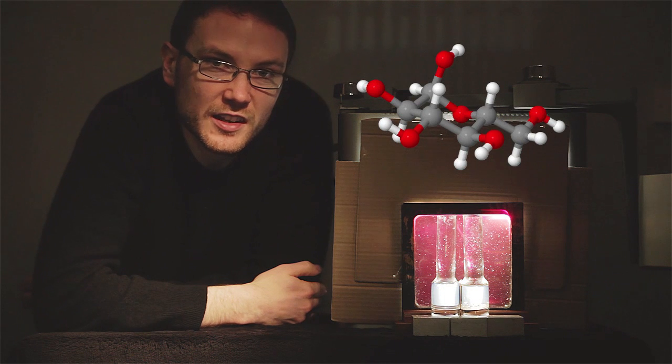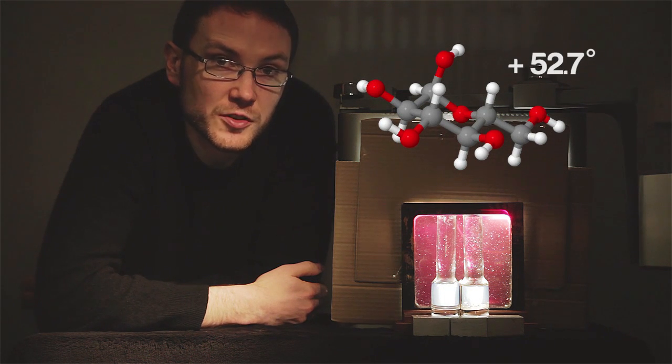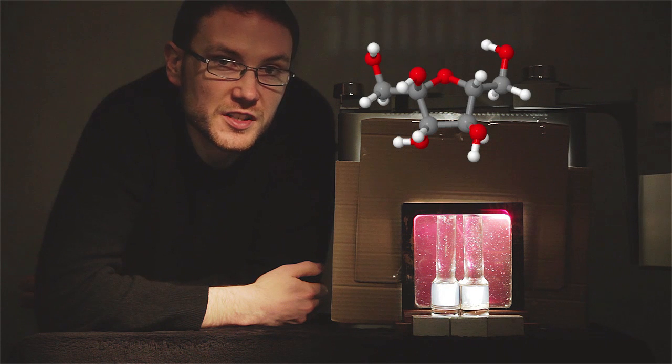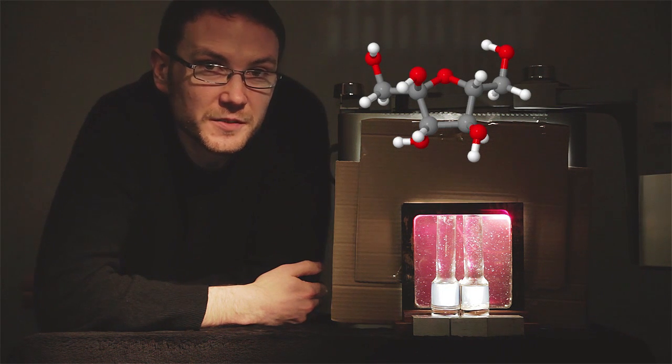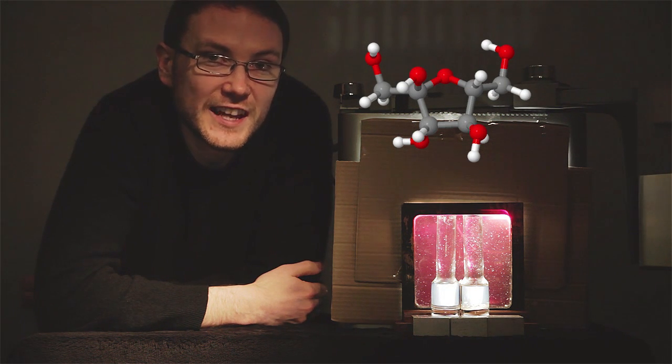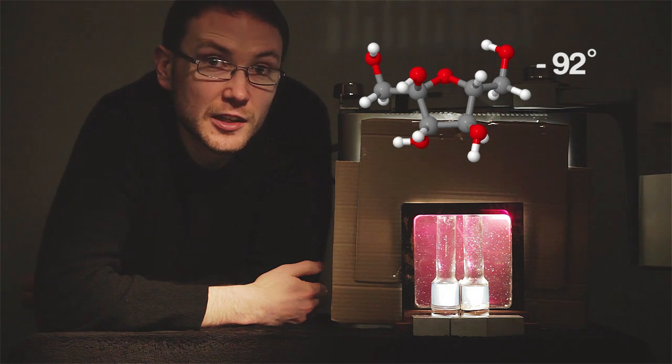Glucose rotates light to the right, hence also being known as dextrose. Fructose, which is sold in supermarkets as fruit sugar, rotates light strongly to the left, and is also lesser known as levulose.